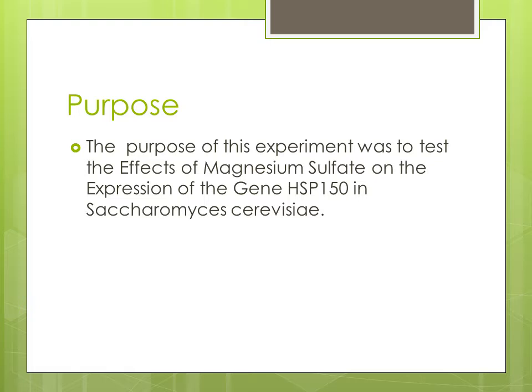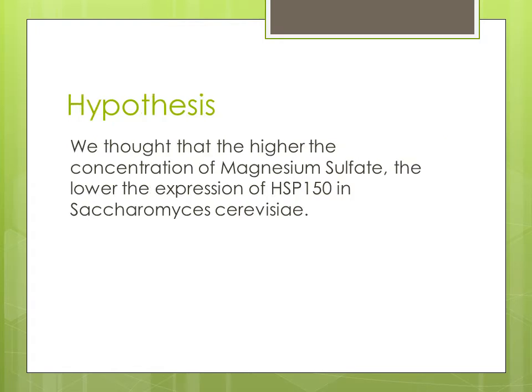The purpose of this experiment was to test the effect on the expression of HSP150 with different amounts of magnesium sulfate in Saccharomyces cerevisiae. Our hypothesis was that the higher the concentration of magnesium sulfate, the lower the expression of HSP150 in Saccharomyces cerevisiae.